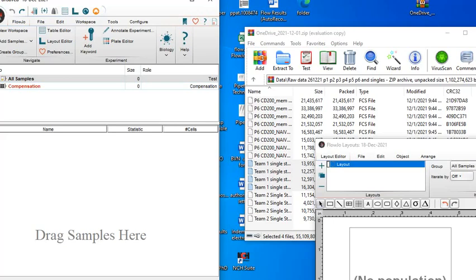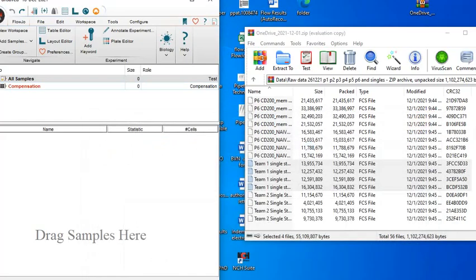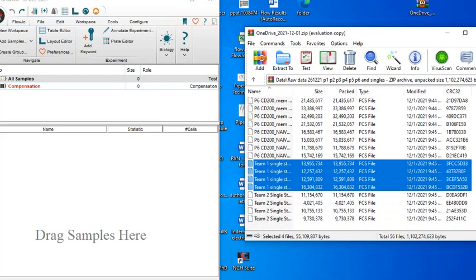Here before us is the Flowjo software, and we have analysis from the flow cytometry. It's one of my analyses. So I'll just give you a little rundown today on what is expected and how the Flowjo looks. Typically, this is the background of the Flowjo. You're going to see it look like this, and it tells you drag sample here, and we have the samples on the right side of my screen.